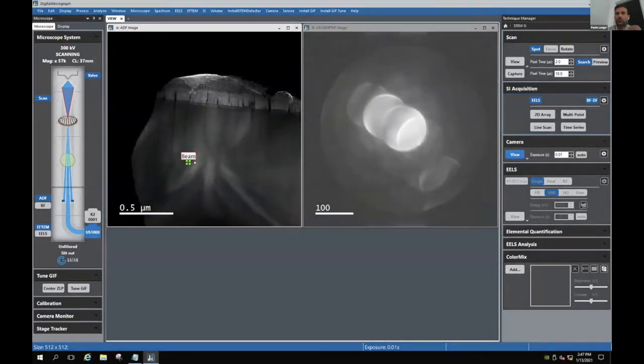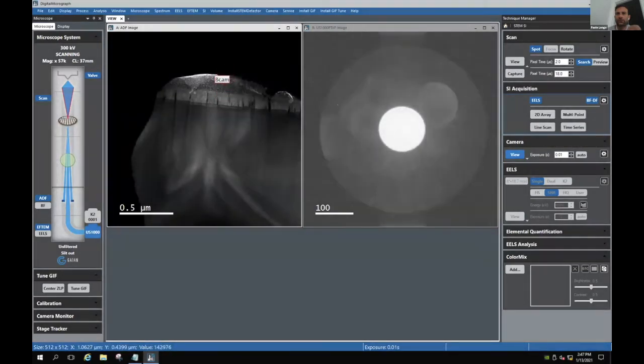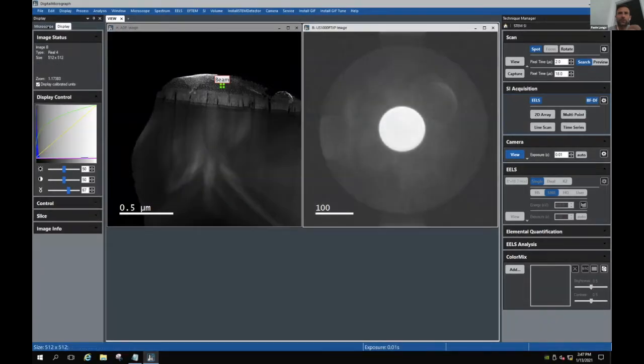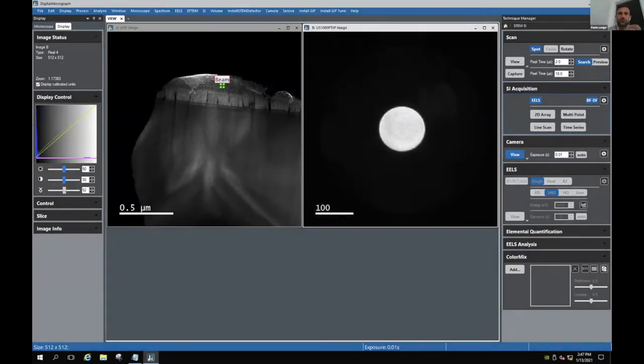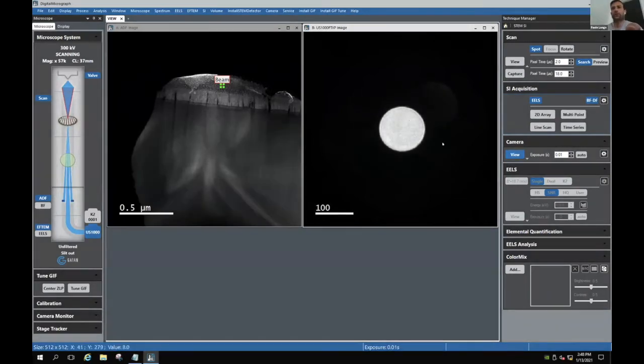Okay. What we have to do in general, when you've done the amorphous material, is let me go back. Oh, that's fine. So it's basically over here. You can show them how to quickly measure the alpha beta. Oh yeah, it was the one thing that you could do when you're here. If you go through focus, you could go through focus.